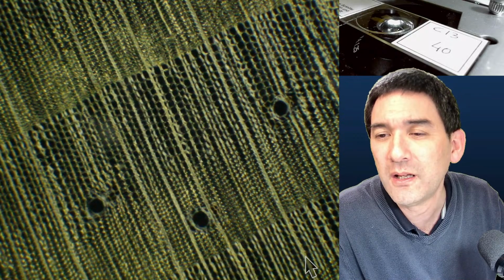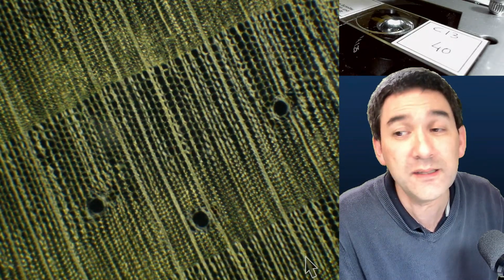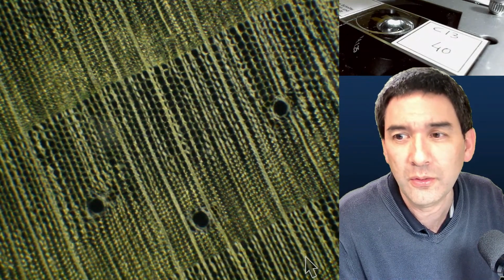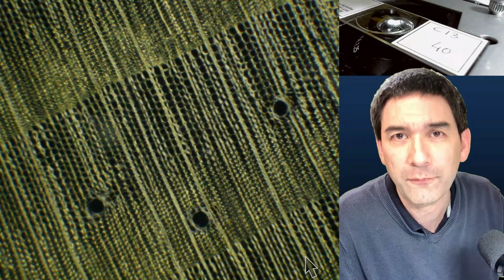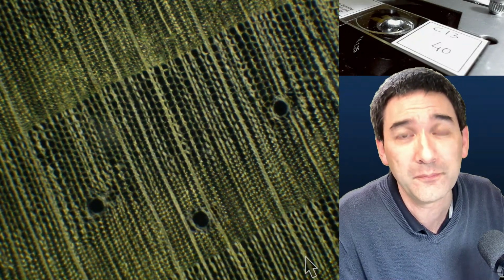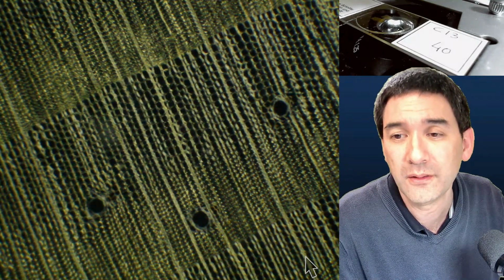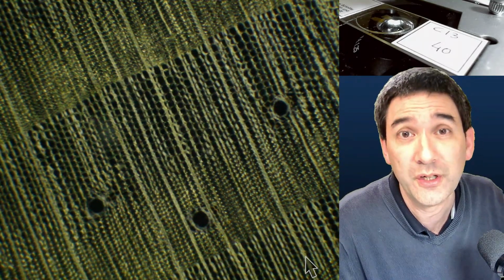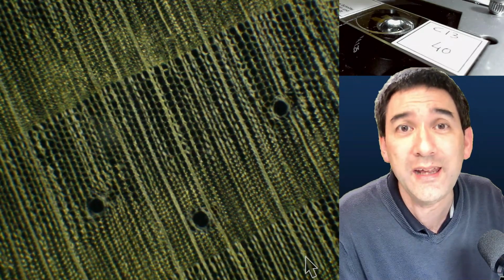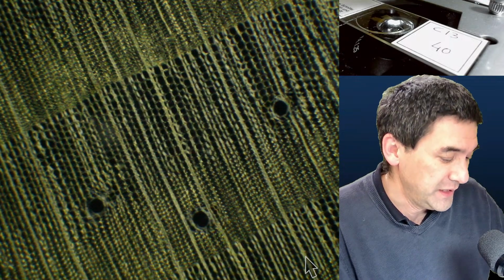It's fine, but for a sample with movement, it's quite laggy. Yeah, the laggy part is the low frame rate. So what you would like to do is, in the app, try the following: go up with the gain, go down with the exposure time, and go down with the resolution. If you really want smooth video: a low resolution, high gain, short exposure time. Again, a lot of experimentation here.